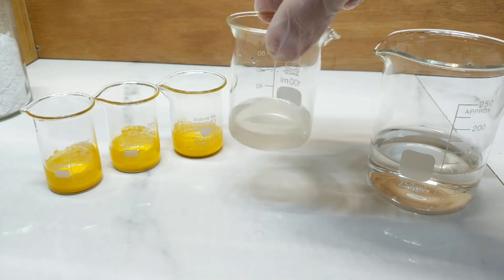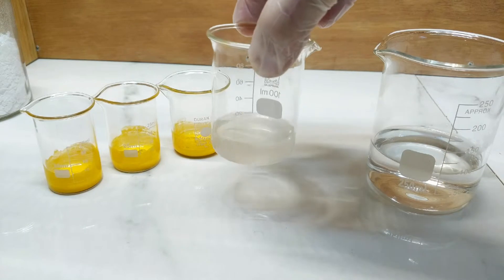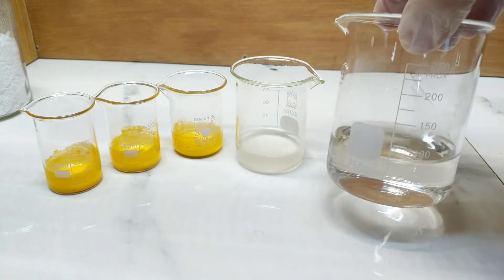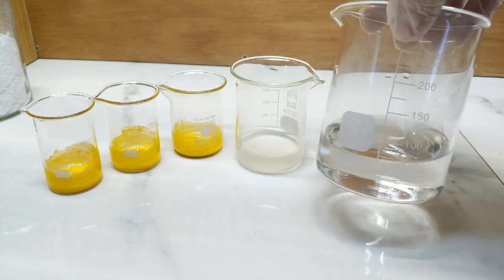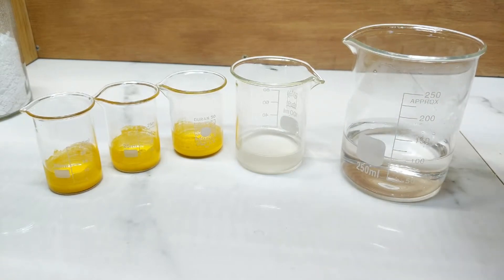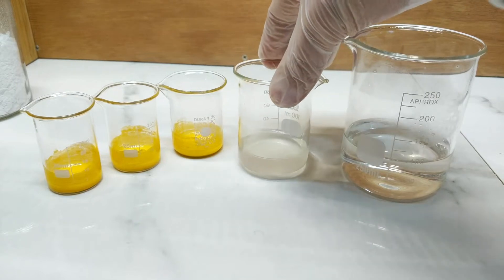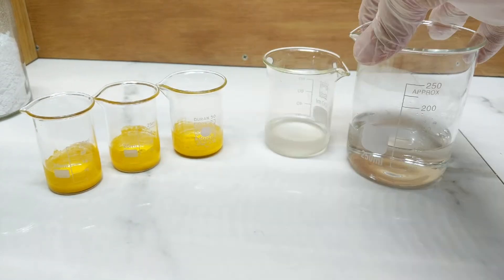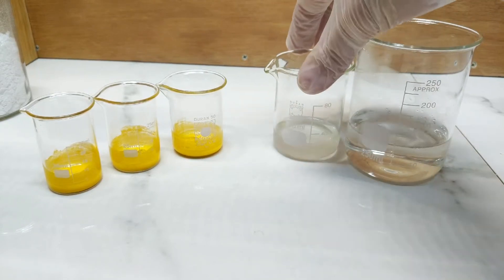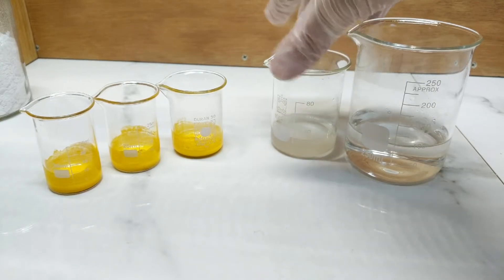Firstly, I've made up a solution of the lead acetate, where I've just dissolved one gram of the lead acetate in 20 mils of water. I've also prepared a warm one molar solution of potassium hydroxide, which I'm going to add a small amount of to the lead acetate so that I can produce lead hydroxide. We should be able to precipitate out some form of orange-red chromate pigment from the basified or alkalized lead solution that I'm making here.